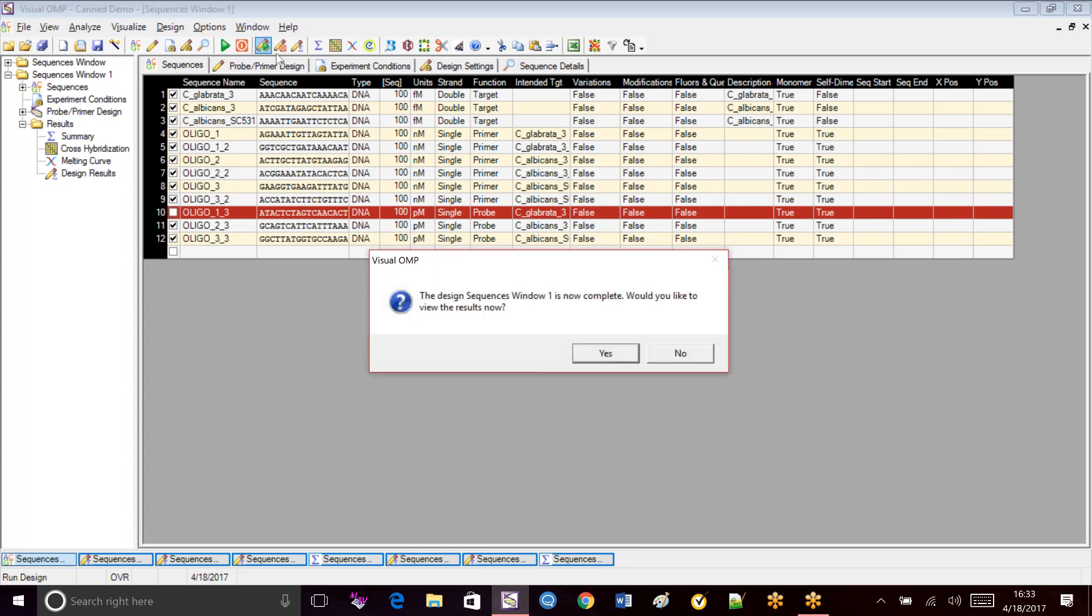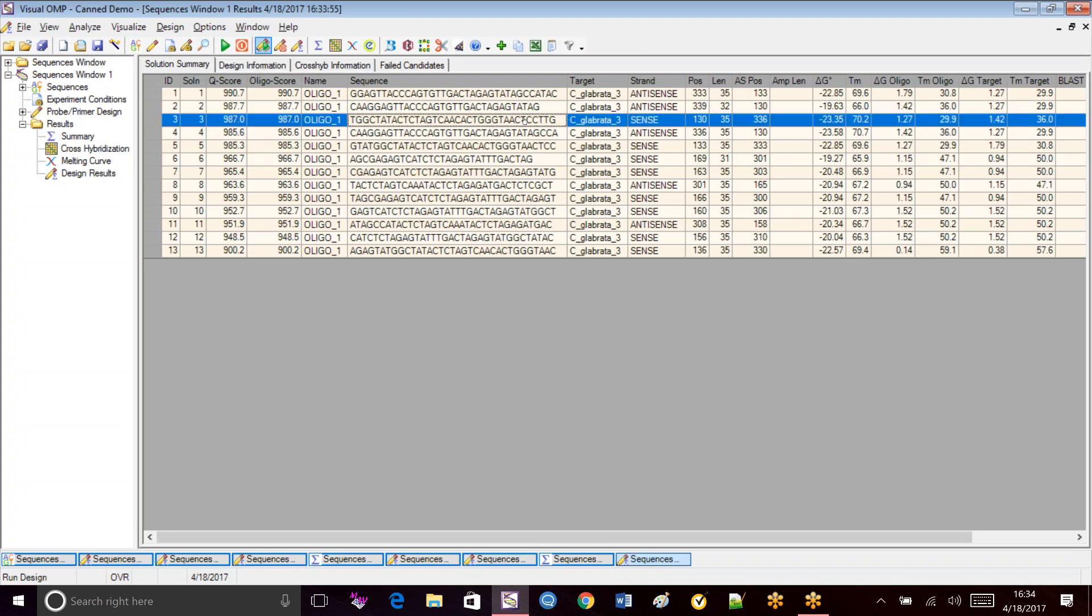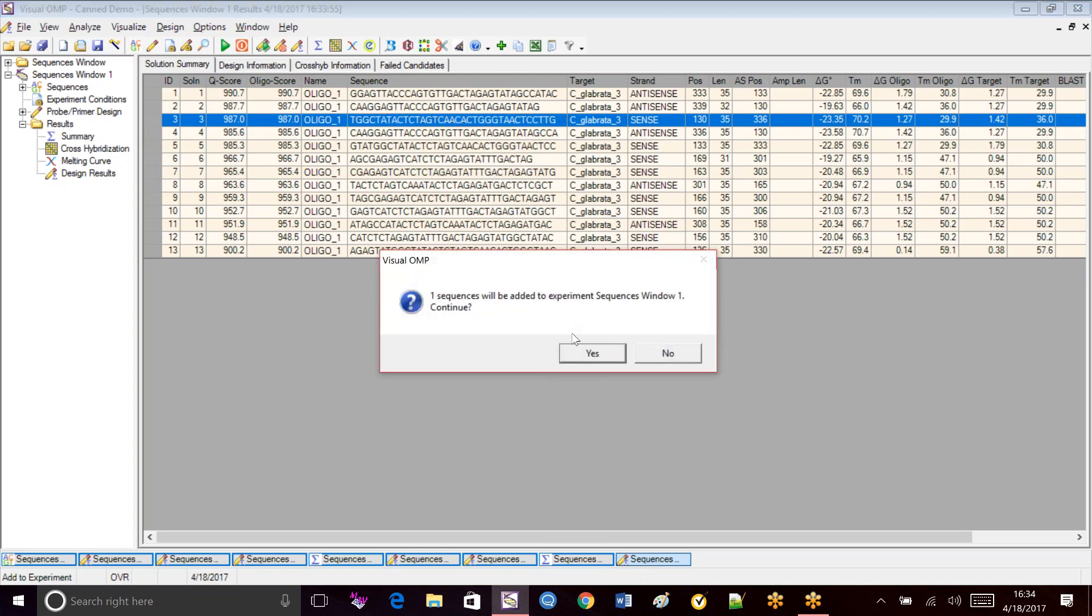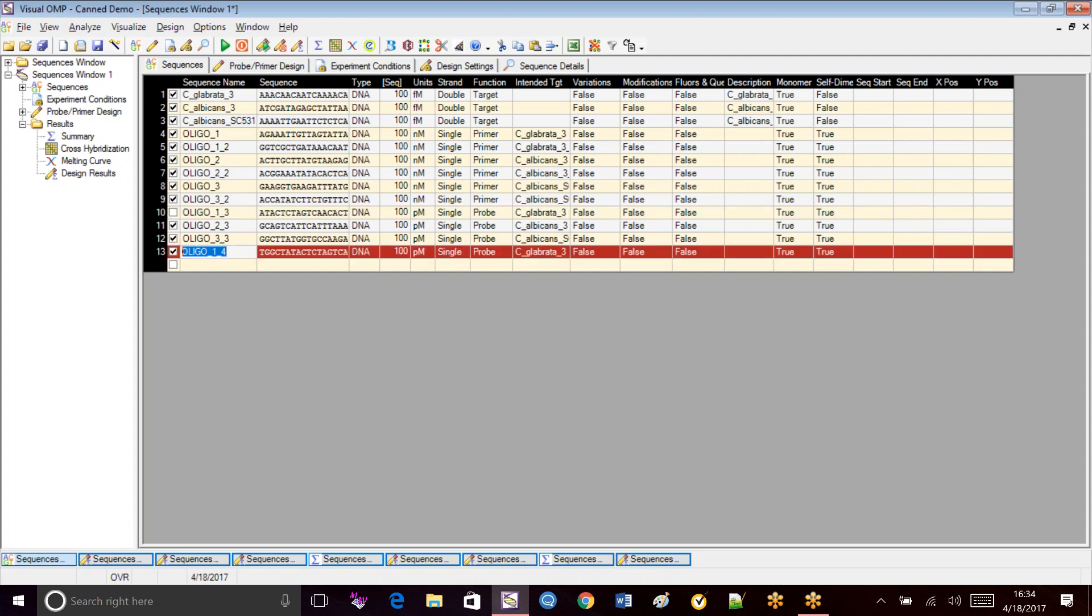So we go to run design. And you see we have longer probes now. So each of these is a little longer. This is 35, which is the maximum we asked for. And again, I like working with sense strands. And you can target either sense or antisense, depends on what you want to do with your project. So I'm going to add that to my experiment. So this is my new Glibrata. I can even name it. So I can keep track of it. My new Glibrata probe.